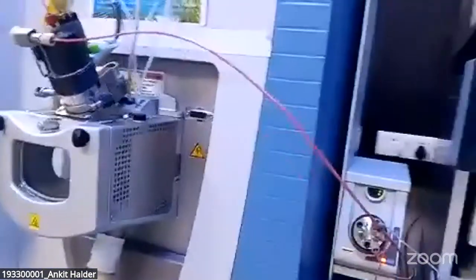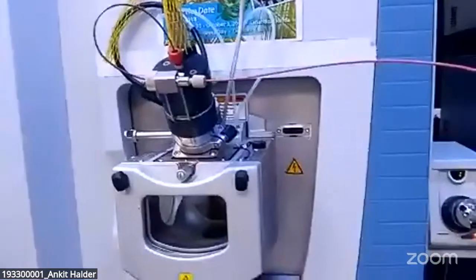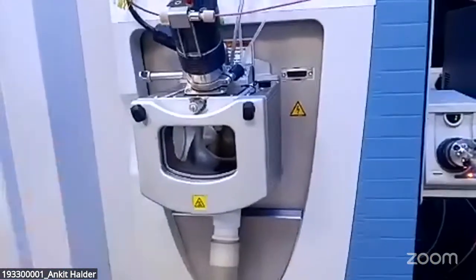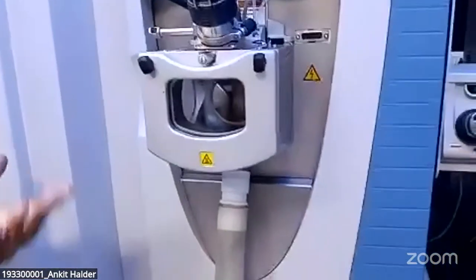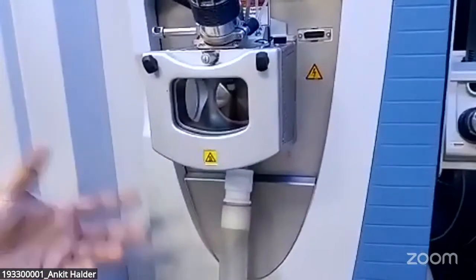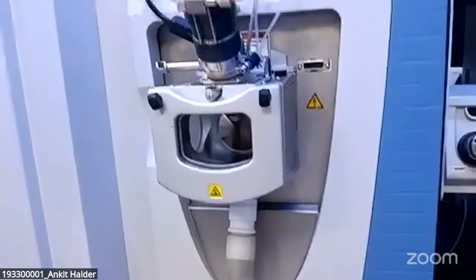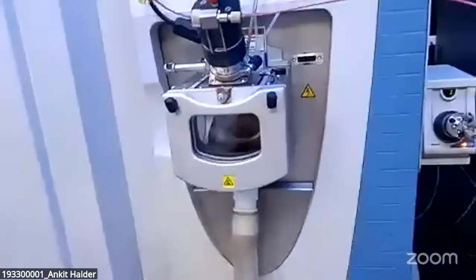So the very first thing you need to know, as you have already learned in the courses, is what hard ionization and soft ionization techniques are. Within soft ionization, there are techniques like MALDI and ESI. So it uses the API, atmospheric pressure ionization, which is the ion source, and the mode is ESI, electrospray ionization. In case of MALDI, only single charge ions are generated, but in case of this ESI source, multiple charges are generated.